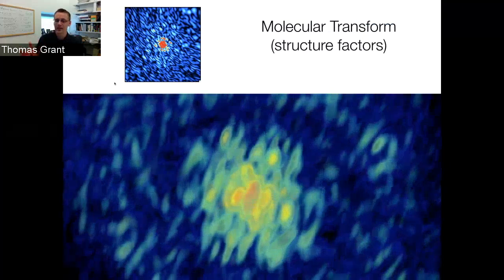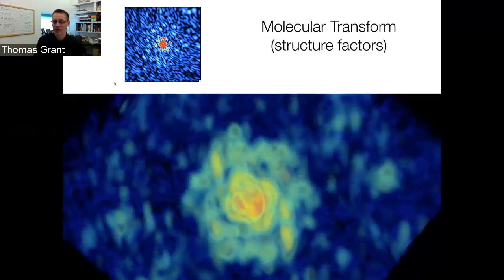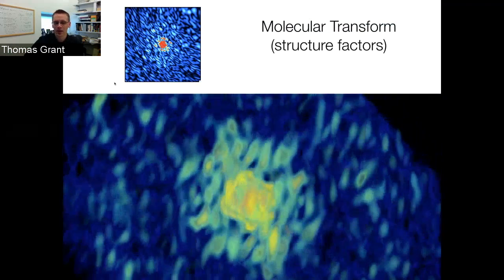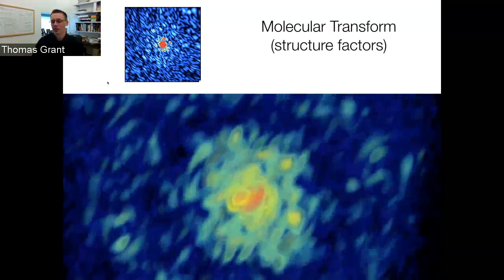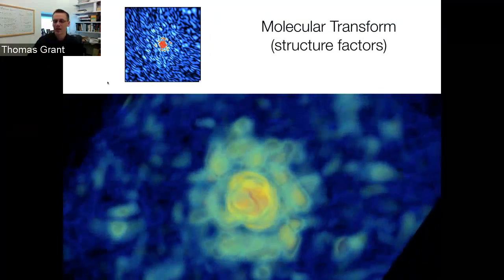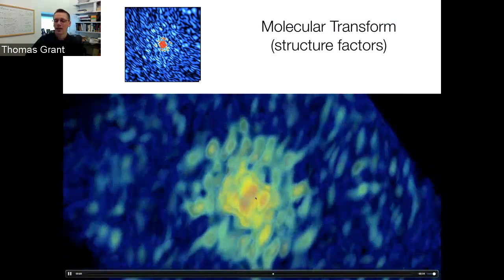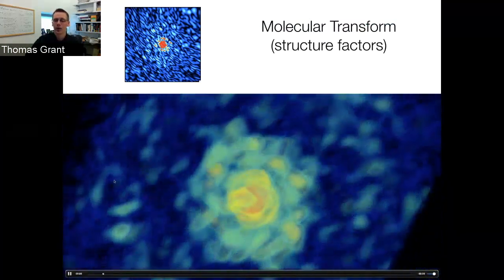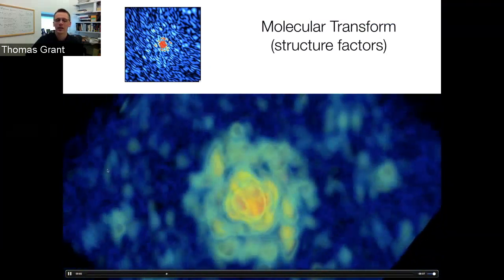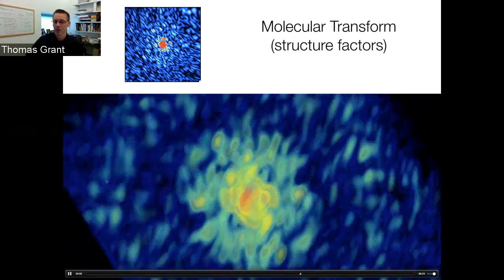So we actually take lysozyme, calculate the Fourier transform of the electron density, and this is what we get. And you notice that this is a continuous distribution of intensities in reciprocal space. It's a 3D space, and you notice that we have a very bright blob at the center. That's our small angle region. And then as we go out to wider angles, it's much dimmer, much fainter, less intense, and the fluctuations are continuous.